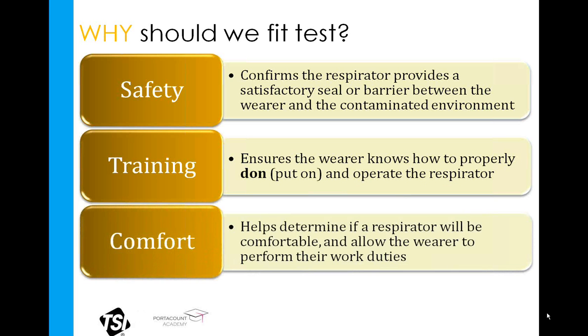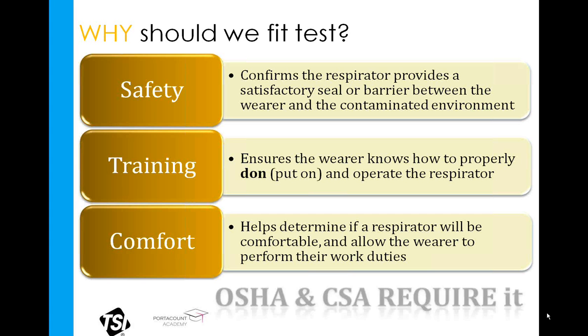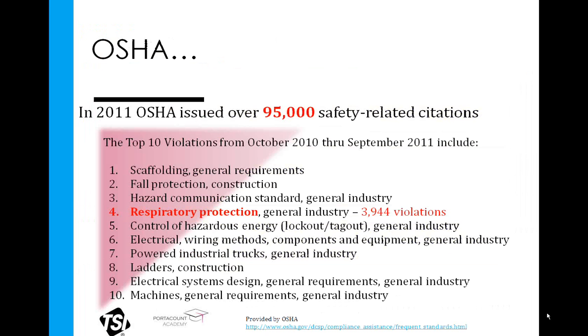The third aspect is comfort, and I believe this is a topic that is too easily overlooked. We want to make sure that the respirator is comfortable to the employee, or as comfortable as it can be. If the respirator is not comfortable, the employee will not don the respirator properly when in the field, or worse, they may just remove it completely. And of course, always a good reason to perform respirator fit testing is that OSHA, and in the case of Canadians, CSA, require it.